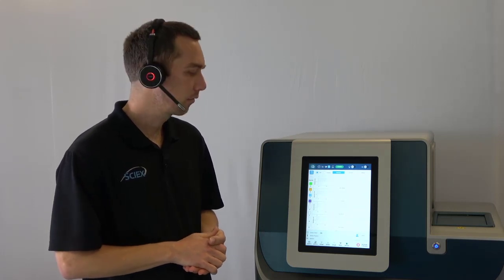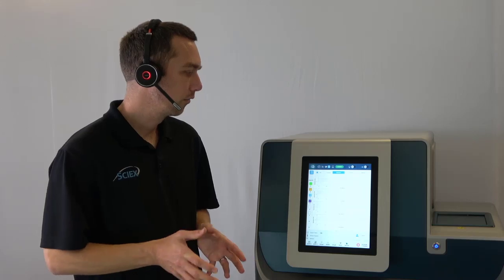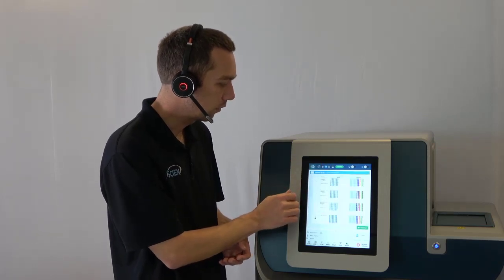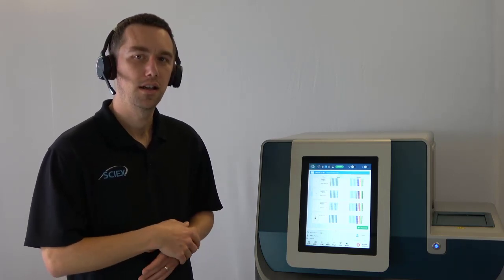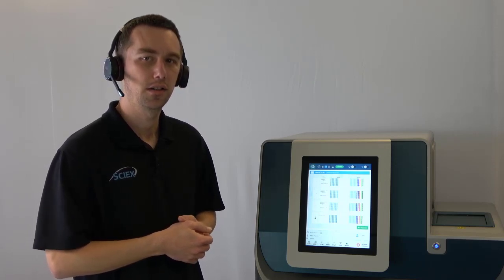As I mentioned earlier, one of the things we want to do when we're inserting a cartridge is make sure that we're wiping down those O-rings. That's really the only user involvement. From run to run, you just wipe down the O-rings on the cartridge. That's about the only thing that we need to do. We're no longer rinsing down the interface block. The interface block really isn't interfacing to the bottom of the capillary, so there isn't any chance for that residual chemistry to get caught on there, which is very nice.